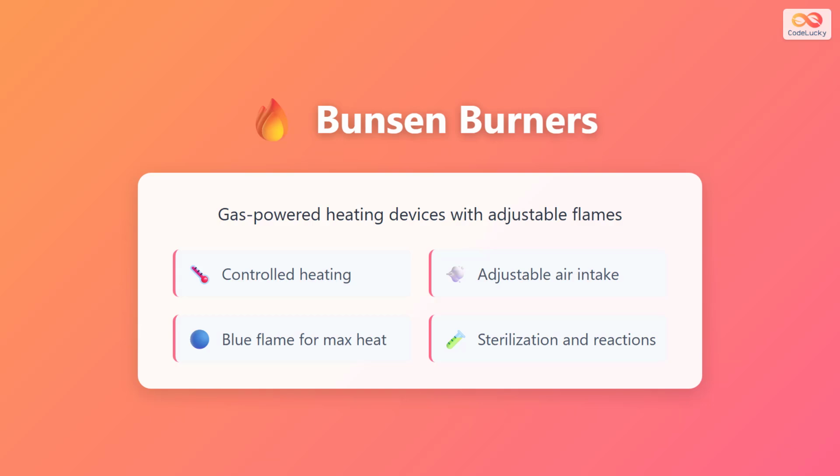This makes it perfect for sterilizing equipment, heating solutions, and conducting various chemical reactions that require controlled heat. Always remember to adjust the air intake to achieve that clean blue flame for maximum heat output.